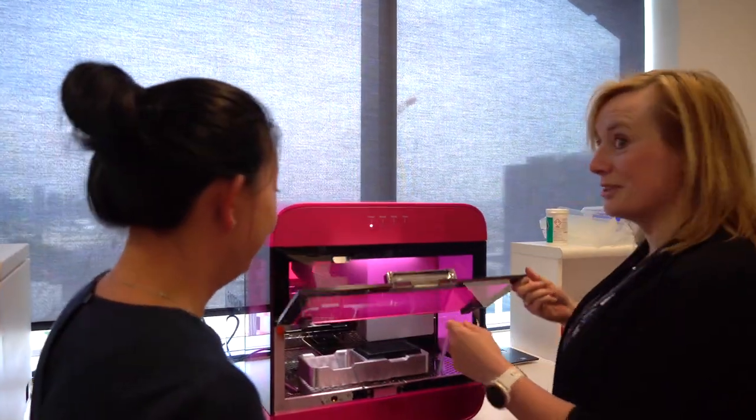Our ultimate vision for using this instrument will of course be how we can accelerate patient therapy. We can envisage a day where we can take patient cell samples, seed them into this system, treat them with the standard of care chemotherapy, also treat them with other therapy options, and look to see whether or not we can accelerate killing the samples and accelerate the whole treatment regime.